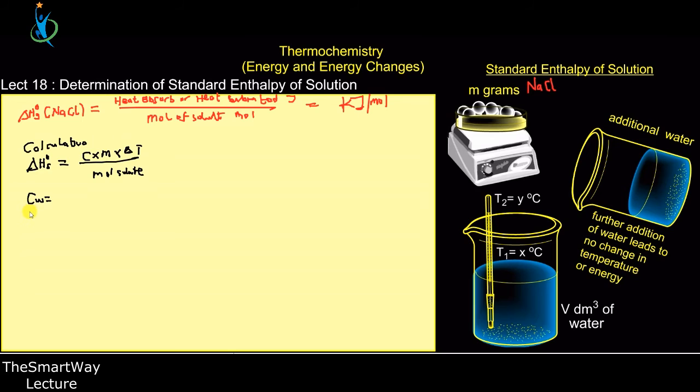And then we have our mass of water. Our mass of water will be found by weighing. You can weigh the water before you start the reaction, or you can weigh it afterward. But this is a very simple thing because we are using only the water. We are determining only the mass of the water. The reason we are doing that is that when the salt dissolves in water, it liberates energy to the surroundings. It liberates energy to the water, and the water picks up this energy, so we are going to use the energy absorbed by the water as the energy liberated from the reaction.